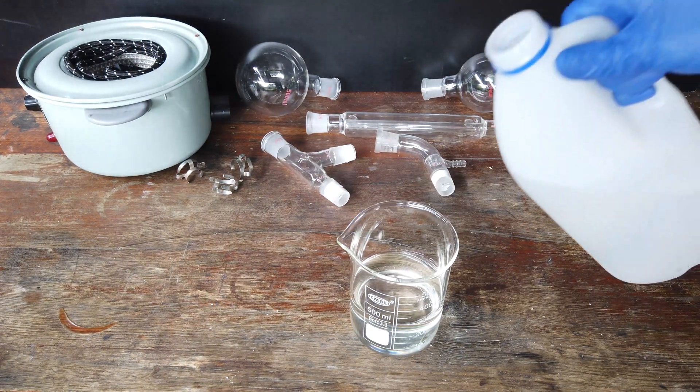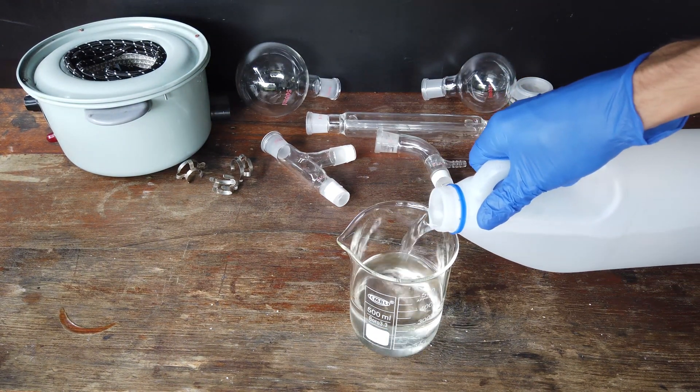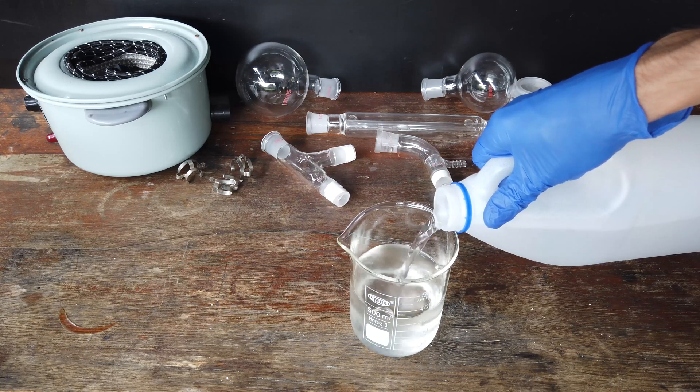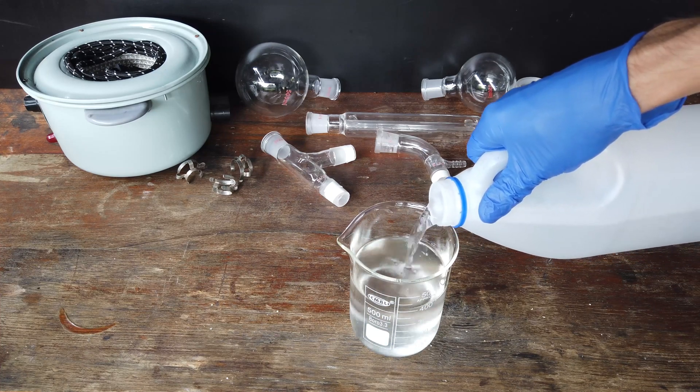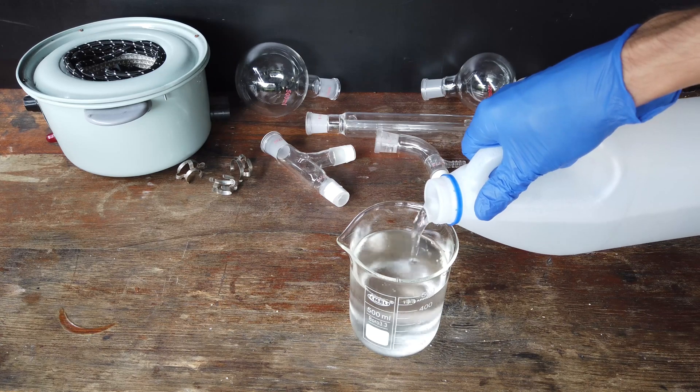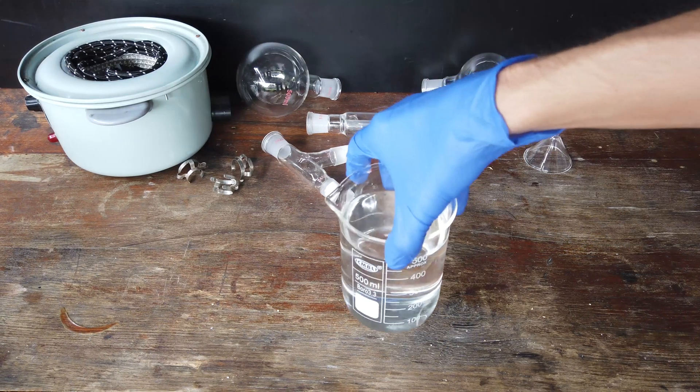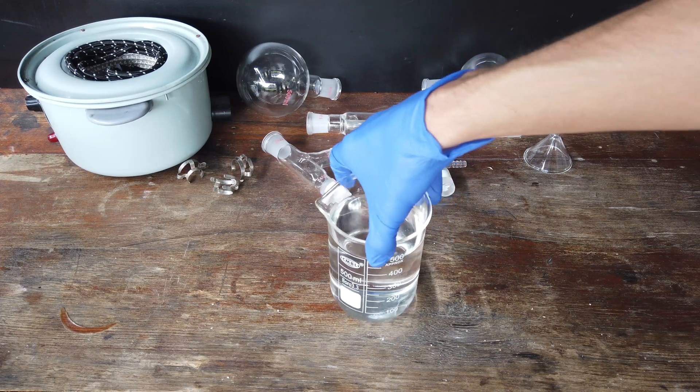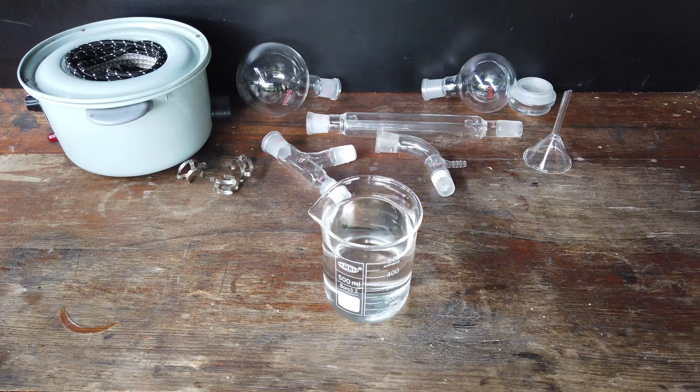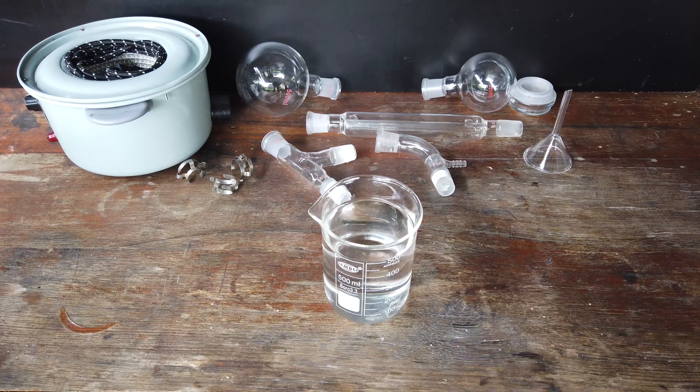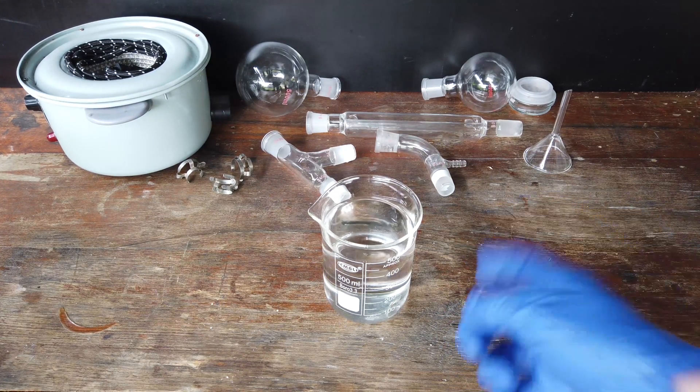Anyway, then I'm just going to top it up to 500 milliliters with distilled water. Not that this water actually needs to be distilled, seeing as we're about to distill it anyway, but that's what I'm going to do. And there we are. That should be about the concentration of the azeotrope ready to distill. If it's not exactly the right concentration, it shouldn't pose too big of an issue.